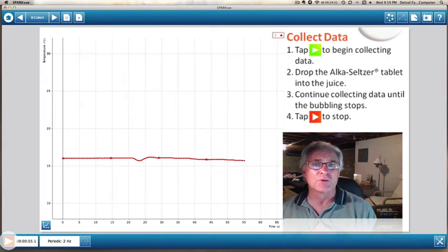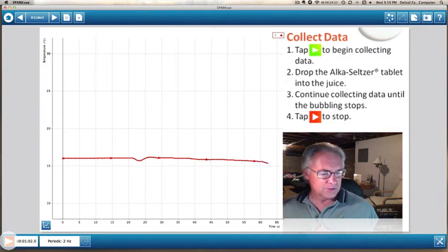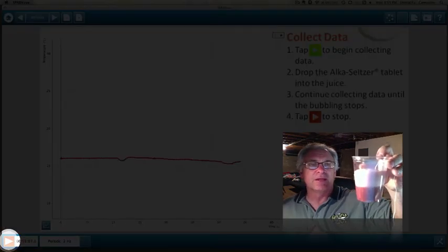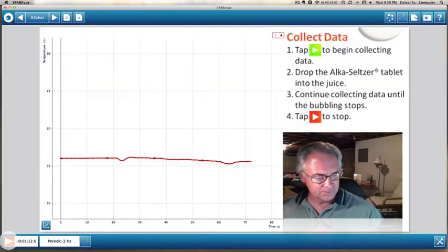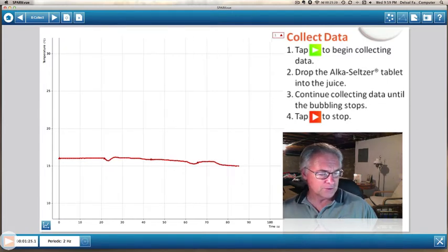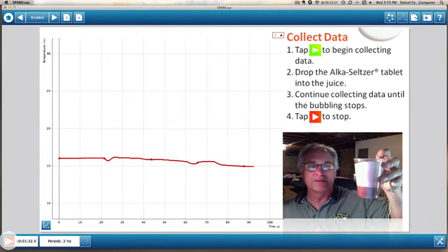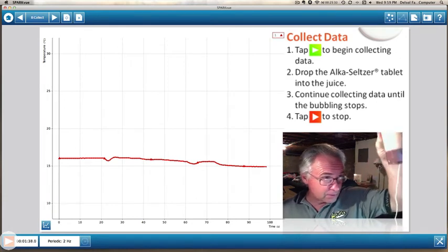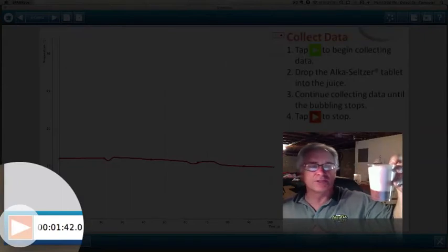If it's more neutral or neutralized, then it may not give us a greater reaction. So we're going to be taking a look at this in just a moment. And it's really starting to fizz now. And I'll show you. This is what we got right here. And it's still fizzing away. And we're going to just let it continue going here. And every time I pick it up and put it down, there's going to be probably a little anomaly onto the screen. But we need just to make sure that we have it going pretty well before we stop it. The reaction is going extremely well now. It looks like it's starting to stop fizzing. It stopped fizzing, so I'm going to hit stop.